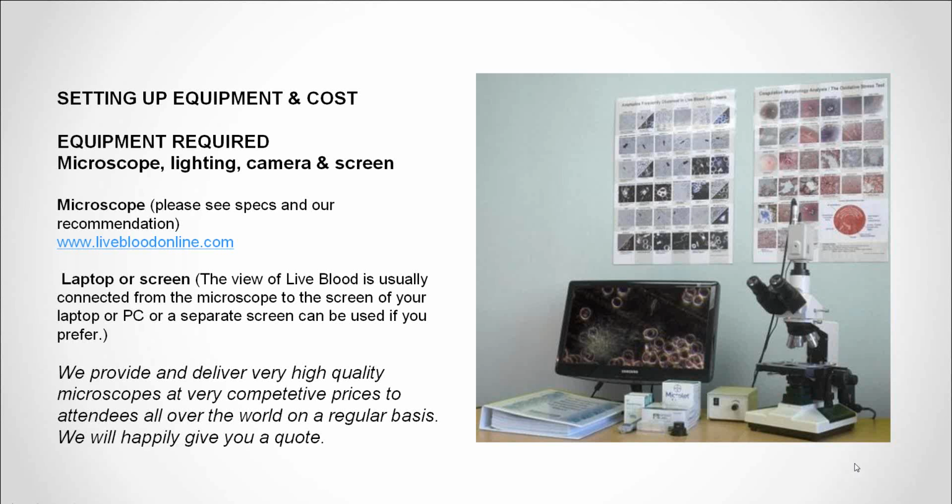So that's just one example, but the issue we encounter most often is actually with the dark field, that it's the wrong type of dark field objective that's supplied. It doesn't give you the correct degree of contrast in a live blood sample, or simply the illumination is just not bright enough.